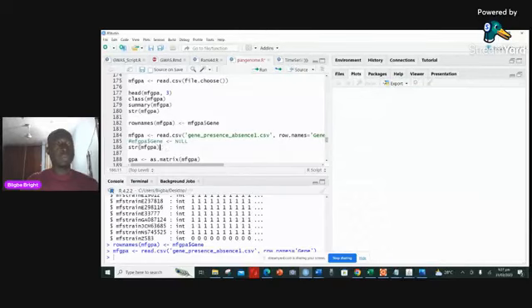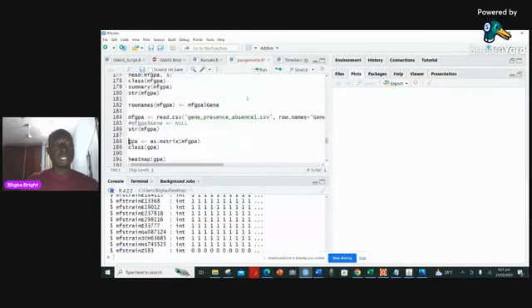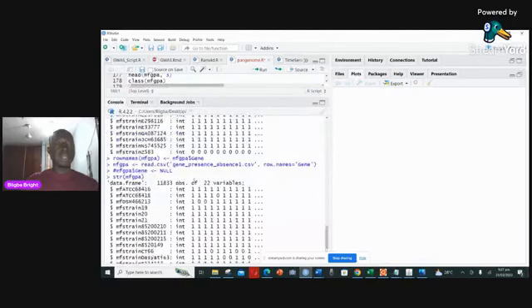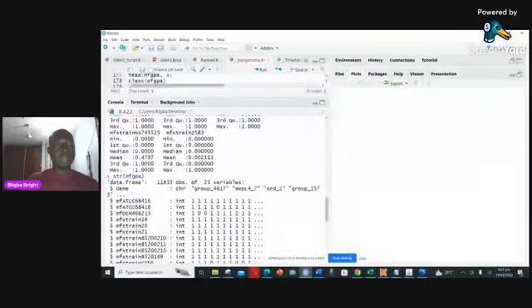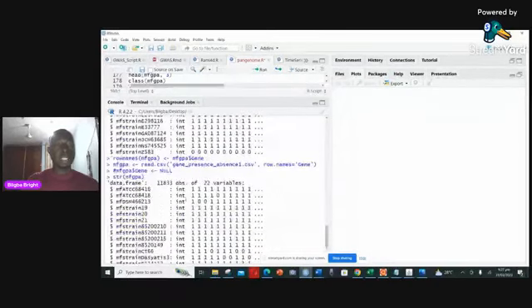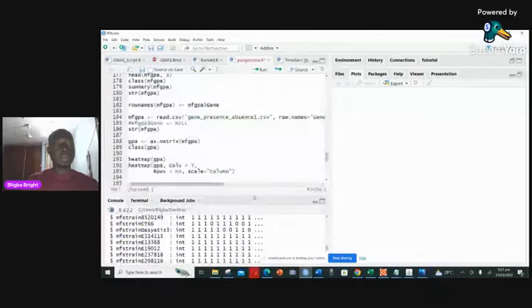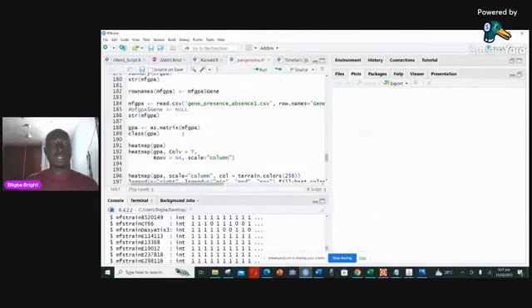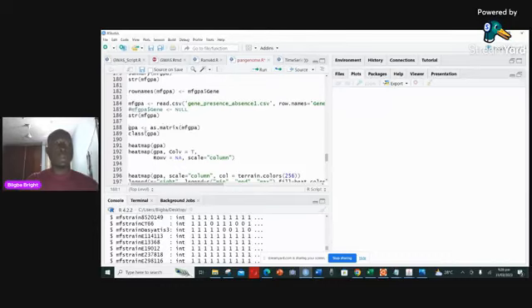If you check the structure again now, you notice that all the variables are integers — you won't see any character, as compared to before where we had one character column. Now we don't have any character; they are all integers. So we are good to go. But since we're dealing with categorical data of this magnitude, it's always good to convert it into a matrix so that you can find correlations. We use as.matrix(), putting the name of the data frame inside.